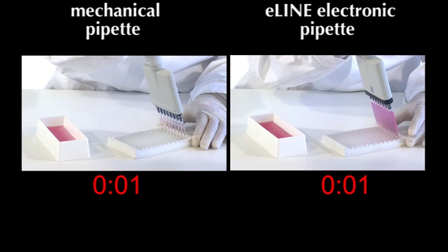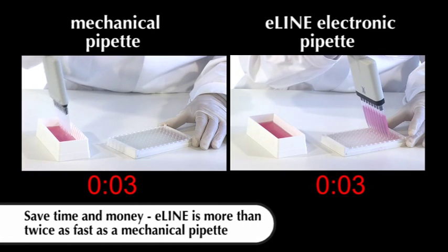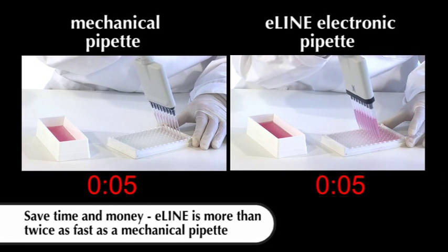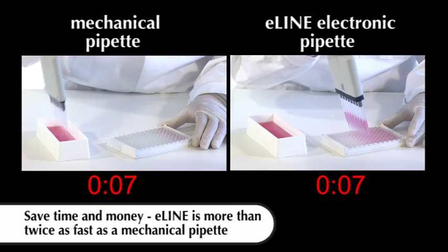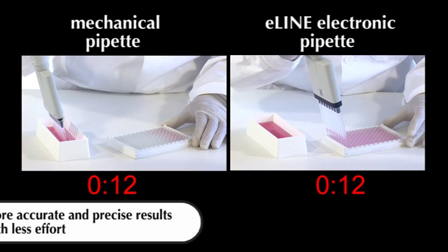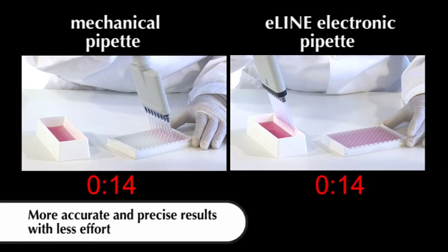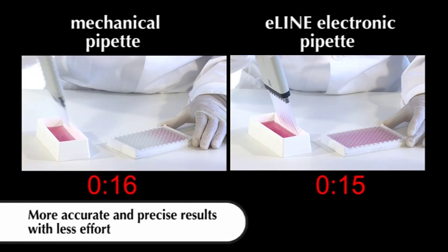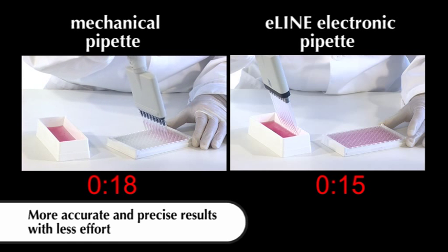The multi-dispensing mode on the E-Line reduces the need for several work stages and enables you to dispense liquids twice as fast compared to a mechanical pipette. In addition, the electronic operations enable the user to get reproducible results time after time, independent of his or her pipetting experience.